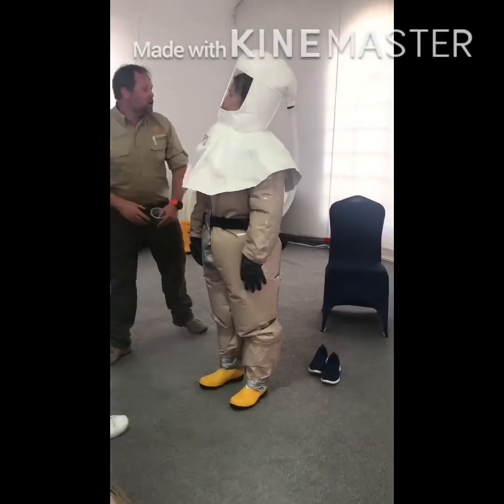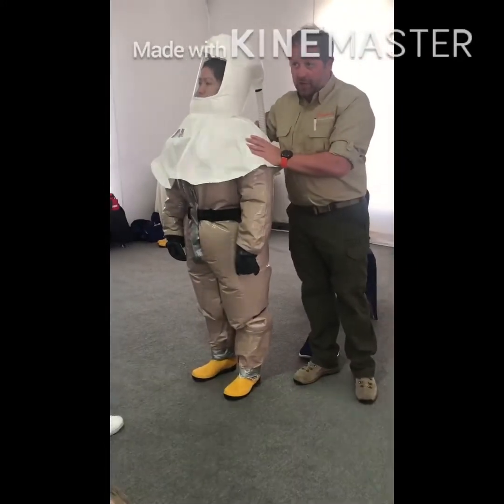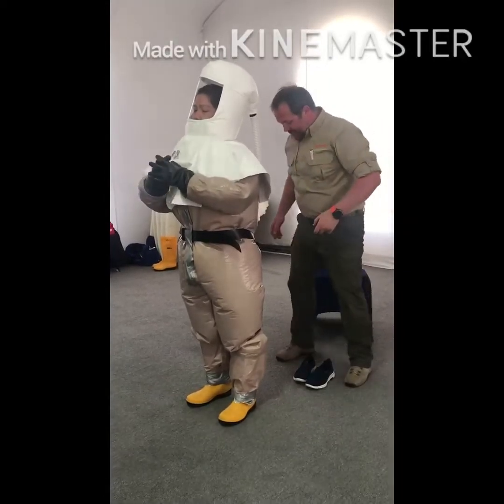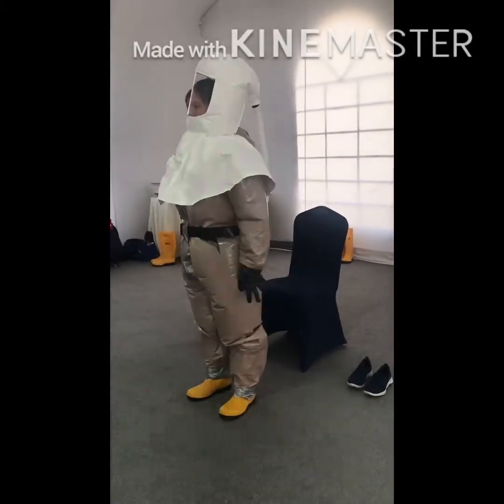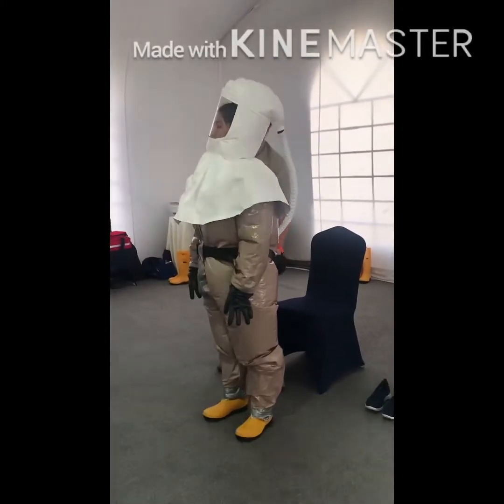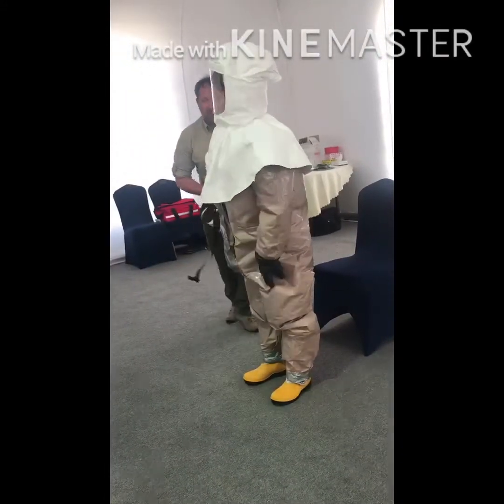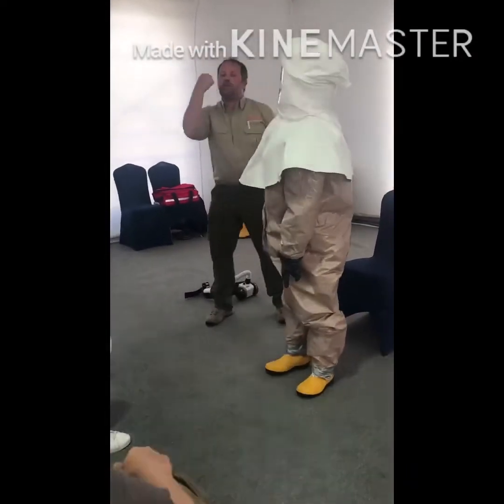Okay, so we've now decided that she's finished working in the decontamination area. So she's going to leave. What's the first thing she goes through? Decontamination. So she's been decontaminated and she comes to the doffing area. I have my seat ready, but she doesn't sit down just yet. First thing I'm going to do is remove her PAPR. So turn it off, remove the hose. That will now go for a more thorough decontamination, because obviously she's breathed into it.